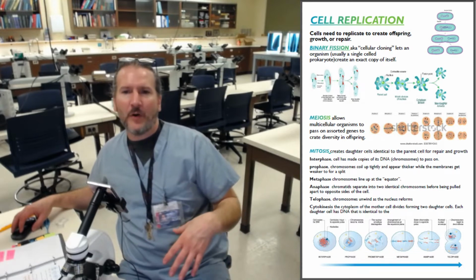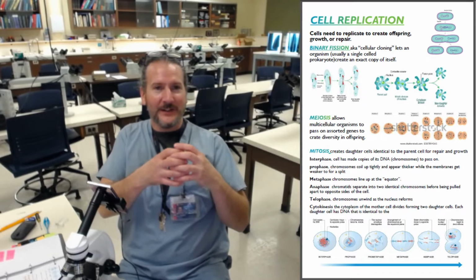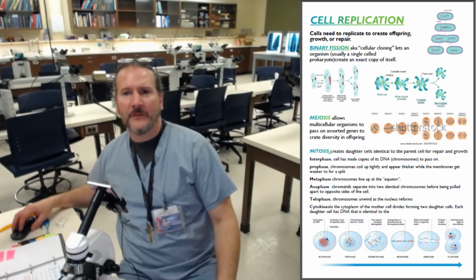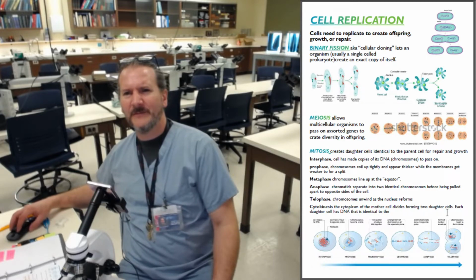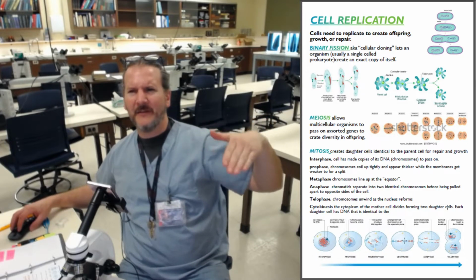Right. Next, prophase, you're going to see the nuclear membrane, the wall, shouldn't say wall, the liner around the nucleus, start breaking apart because that DNA needs to spread apart and go into these two separate cells. Okay. Next, we have metaphase, and metaphase has a special characteristic called a plate. So with metaphase, you're going to see this DNA that's coming out, moving into, oops, sorry, this might be a little better. I think you can see my mouse here. So you can see this DNA is starting to line up right across the equator or the middle of the cell, like that. Right? That's metaphase.